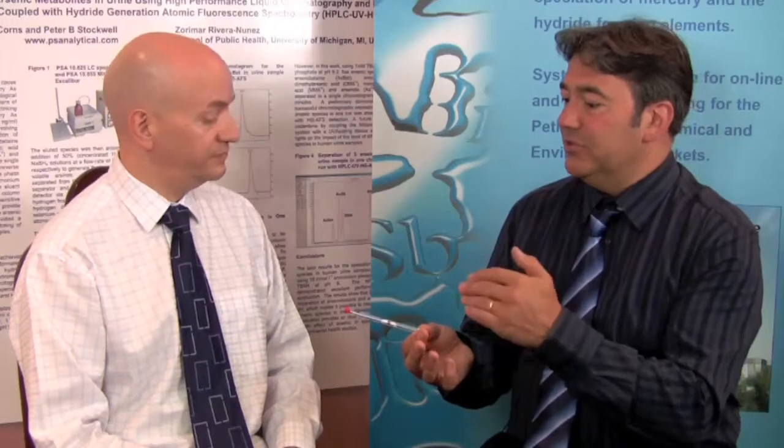So this additional sensitivity that you get from pre-concentration and selectivity offers very reliable measurement.